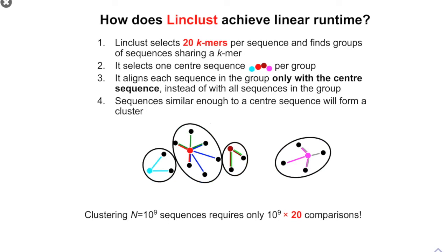And yeah, once we have established our connections, we then just cluster them. We just have to make some separation between these groups so that sequences are not assigned to multiple clusters.